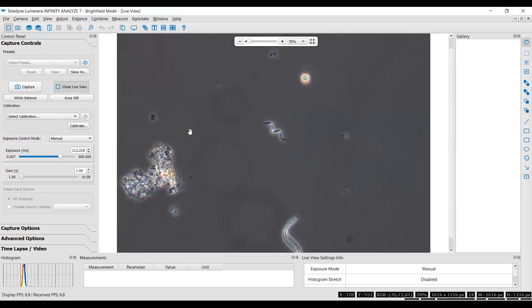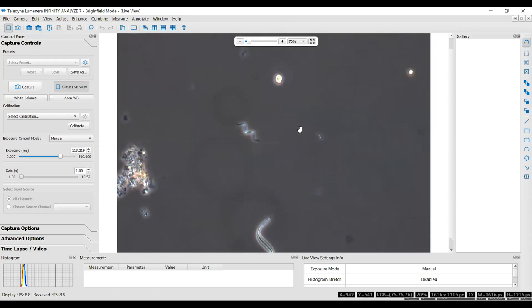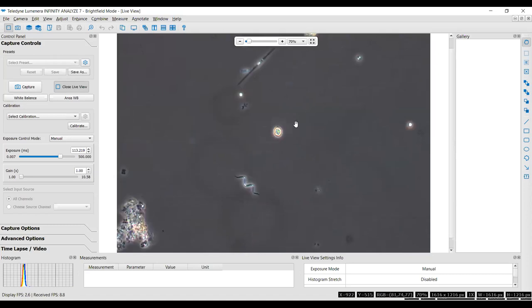And this right here, this quadrat, that is a very small Merismopedia. There's actually 8 cells there, believe it or not. I'm not even going to try to say that species because I always butcher it, but it is the smallest of the Merismopedia. It's really common in the southern systems.